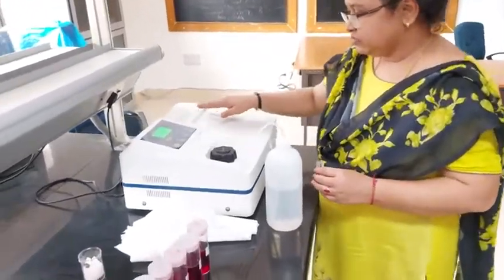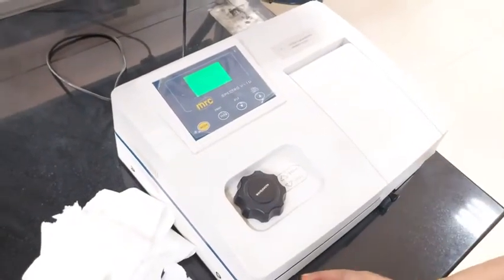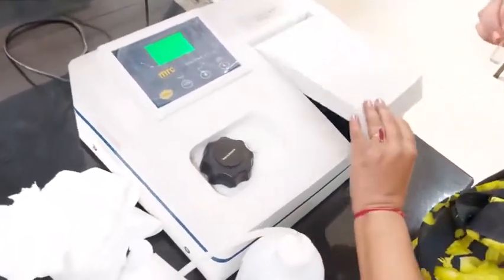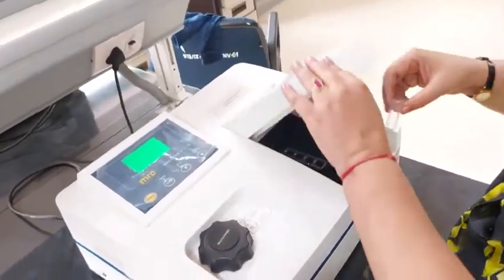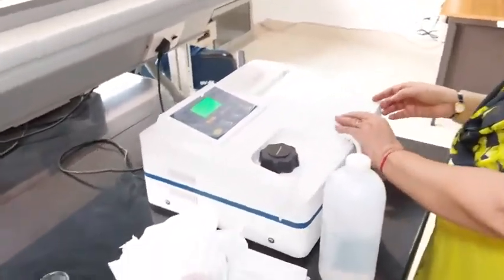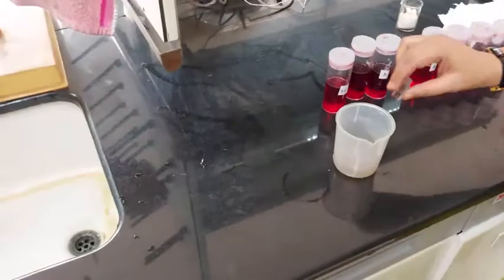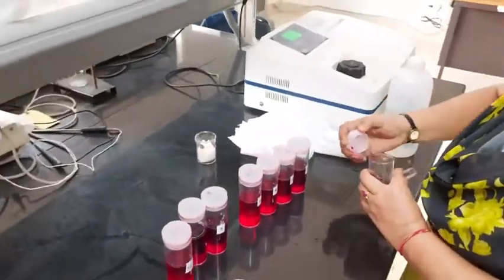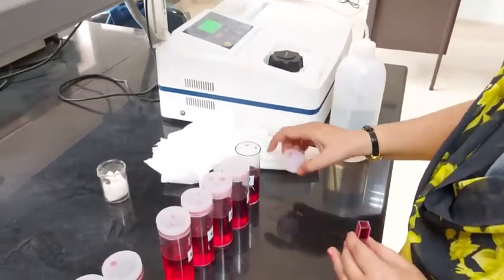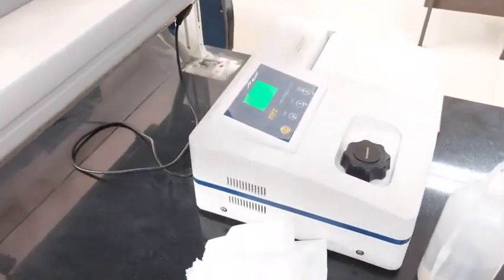This is the spectrophotometer. We have set the wavelength to be 570, and we will set the machine to 0 with the help of distilled water. So I am putting distilled water in a cuvette. This is providing a light path of 1 centimeter. It's 0 now. Now one by one I am going to measure the standards as well as the samples. For the first standard, this is the blank actually, 0, where the reagents are added.